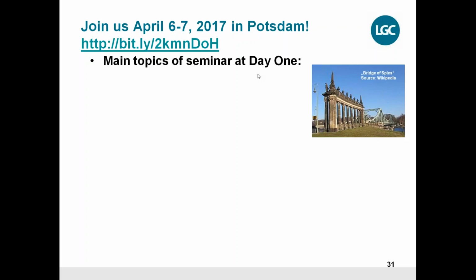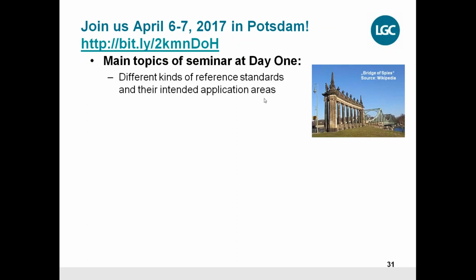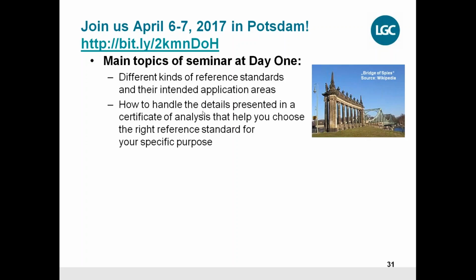But the main topics of the seminar on day one will be different kinds of reference standards and their intended application areas, and we will also see contributions showing how to handle the details presented on a certificate of analysis, which can help you choose the right reference standard for your specific purpose. We also have other experts presenting. We have the EDQM, and we have a customer from Teva who is talking about their issues in quality control and in development of impurity methods, for example. We have the contract laboratory LPU presenting as well, and then us, of course, too. That is on day one.